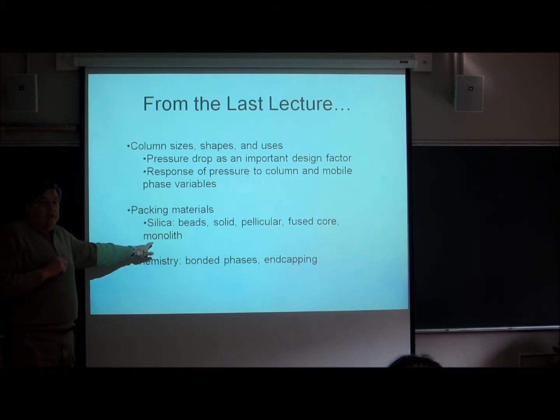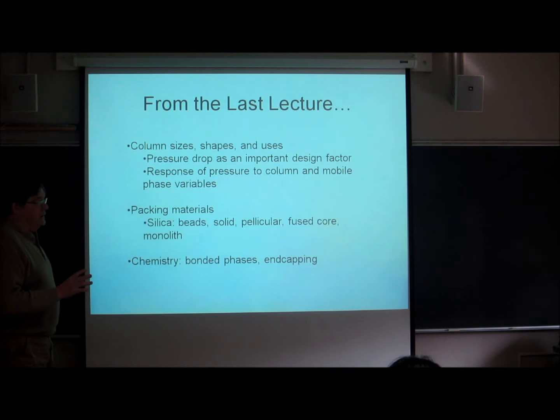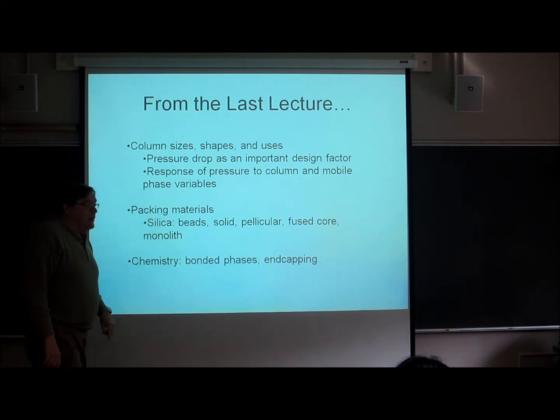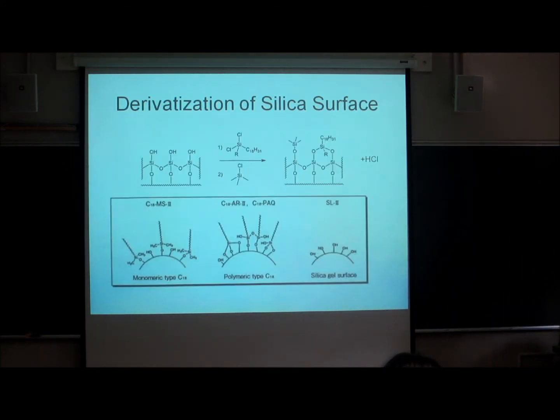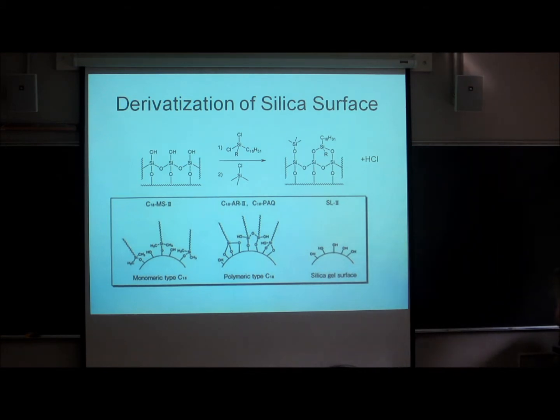All right, and that's more for you to keep your eye on as you keep going in chemistry and hear more about these things. As I said before, I don't know what the news is finally going to be on that. There's some promise to it, but there's also not. We talked a little bit about bonded phases and end capping, and I want to pick up there with a couple of other ideas, because a couple of the statements led me to believe that you still need to know a little bit more about it.